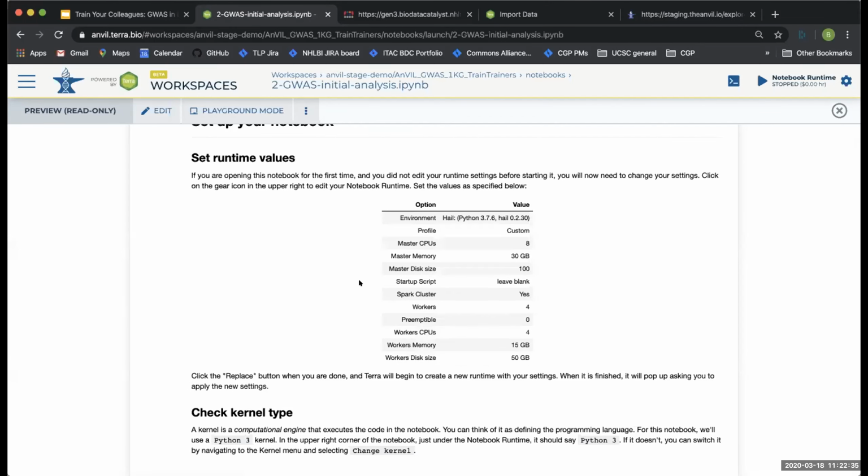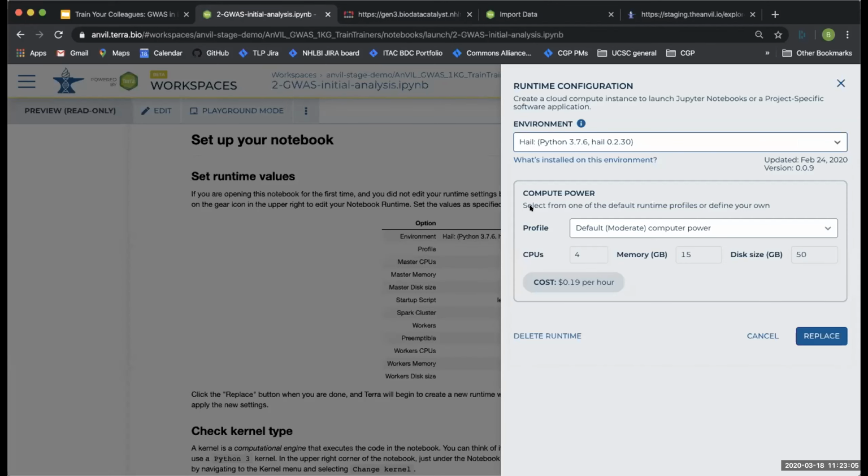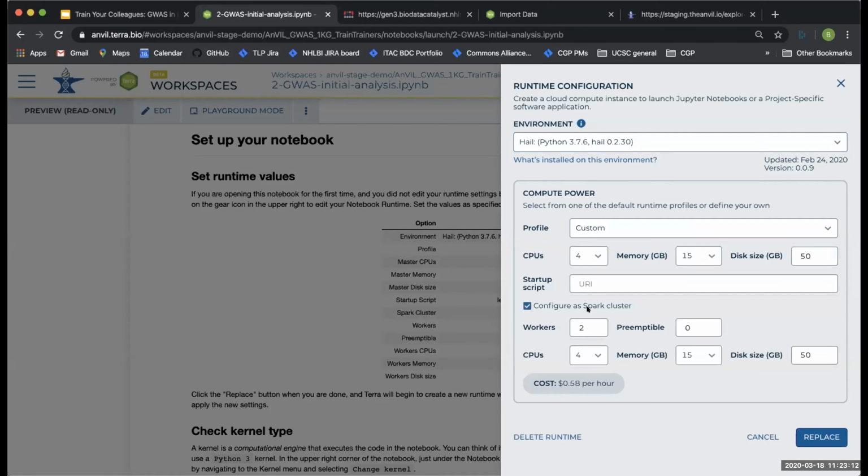In this notebook, we're going to use this package called Hail, which is a Python-based package and is really very nice for working with large genomic data structures. VCF files, particularly from TopMed, are gigantic, and Hail is a way that you can convert a VCF file to a different format and chunk it up into different pieces and then use it with a Spark cluster.